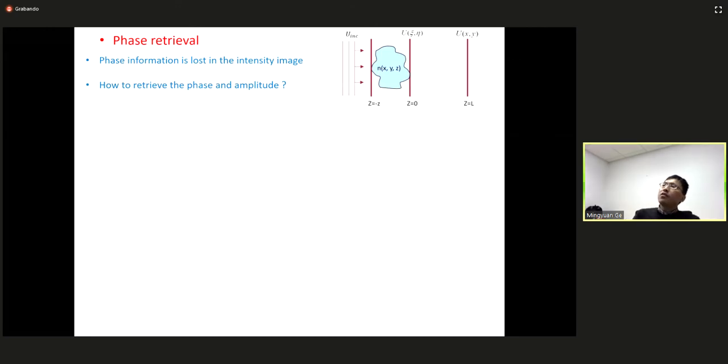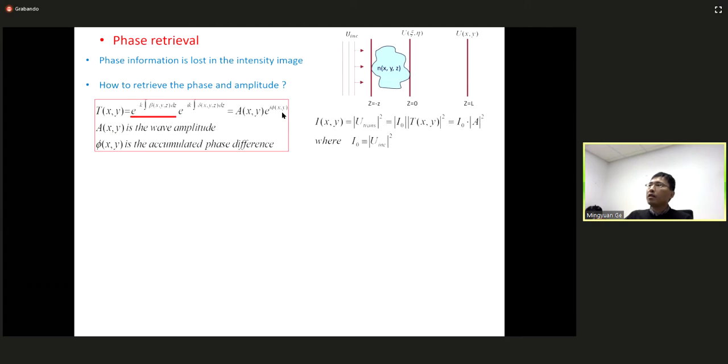So previously we already said that the phase contrast image is very sensitive to the phase, but we only did it qualitatively. We just looked at the morphology. But the question is: is there any way that we can really retrieve the phase of the materials? Is this kind of quantitative analysis possible? The answer is yes.